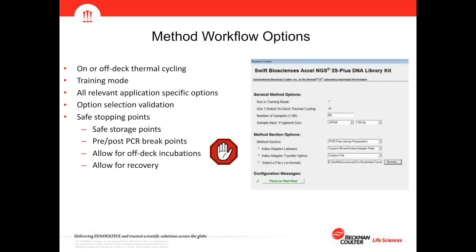So you also have a couple of options on the actual method workflow. So for example, you can decide whether you want to do on-deck or off-deck thermal cycling. So even though we do have the option to integrate thermal cyclers, we can definitely offer integrating just by the workflow off-deck thermal cycling.